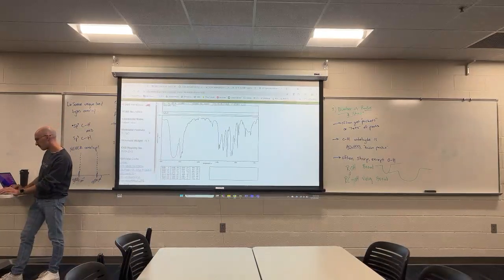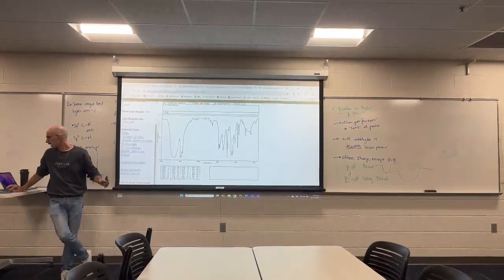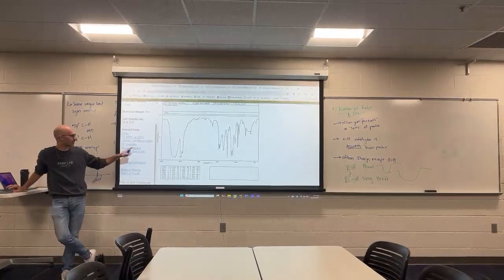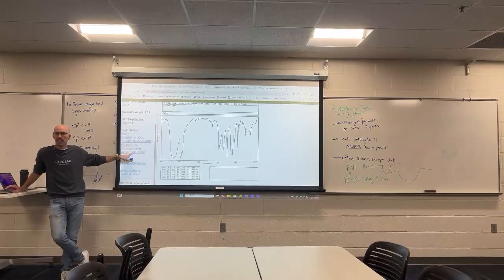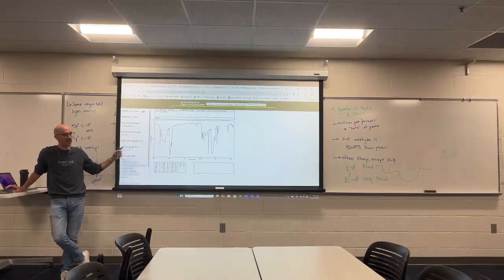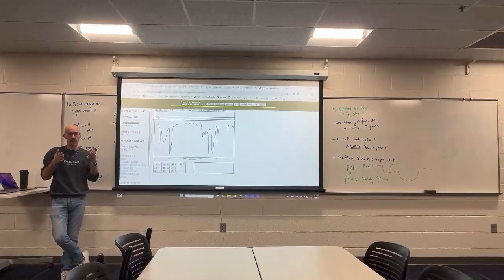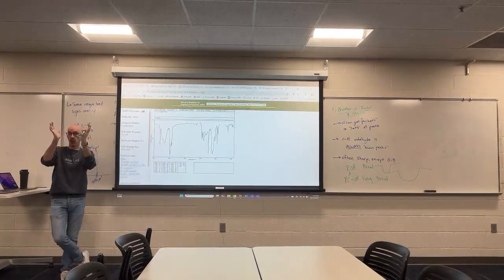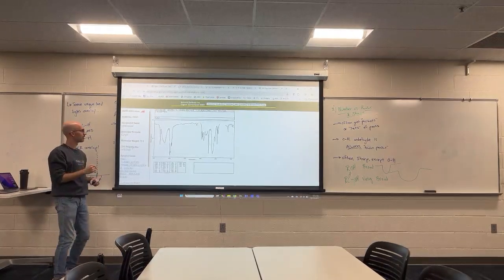There are some compounds that you'll see the IR says like free. If a sample doesn't have any hydrogen bonding, then that absorption goes from being broad to being very narrow, because now the bond has a specific energy type.